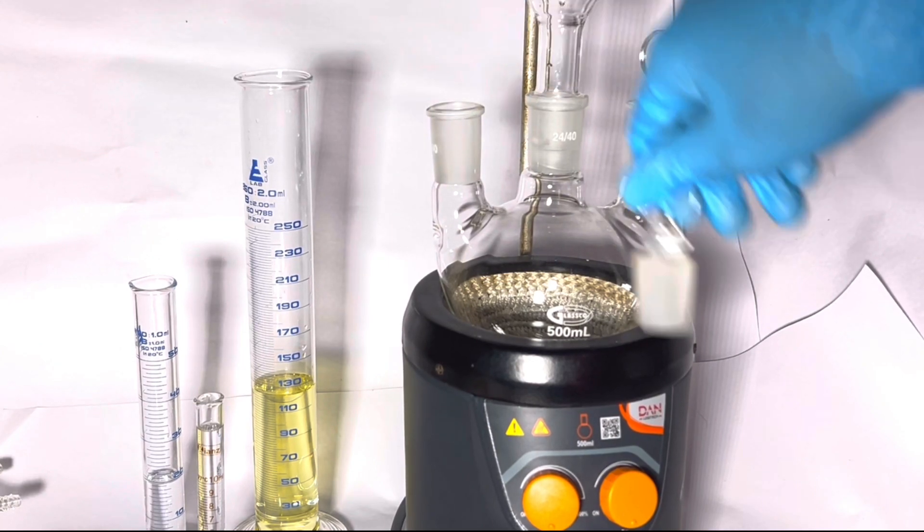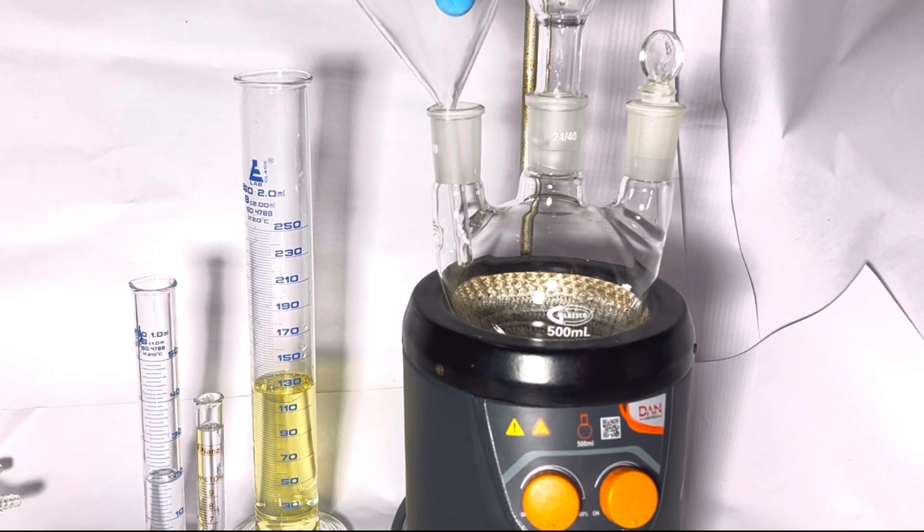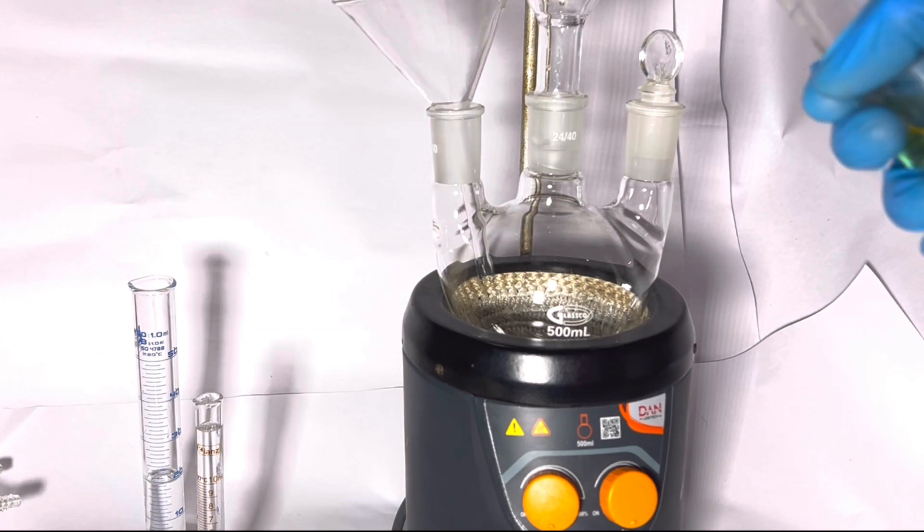Start by placing a funnel through one of the side necks of the round bottom flask and then charge the hydrobromic acid to it.